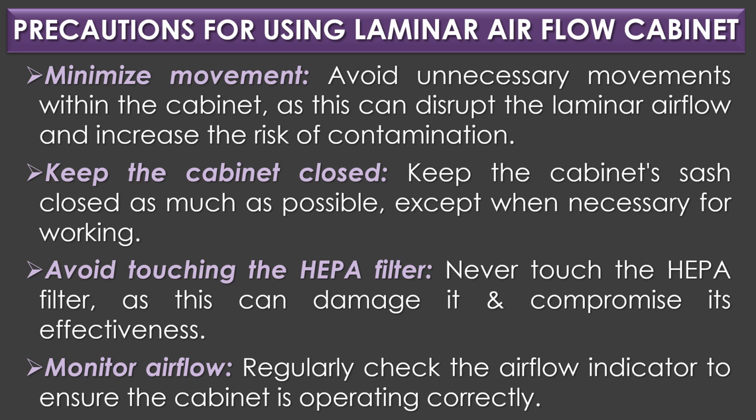Avoid touching the HEPA filter. Never touch the HEPA filter, as this can damage it and compromise its effectiveness. Monitor airflow. Regularly check the airflow indicator to ensure the cabinet is operating correctly.